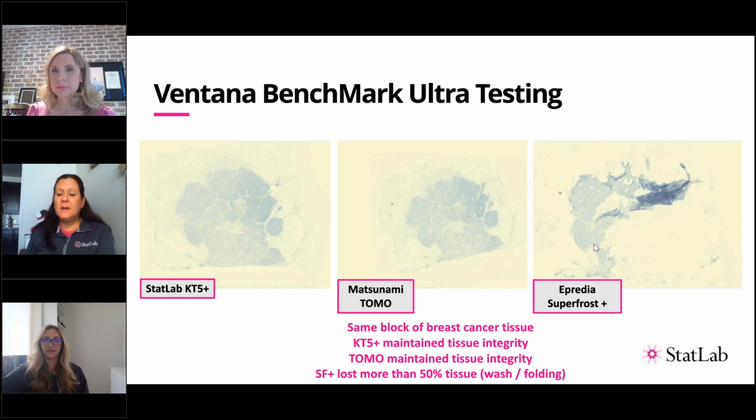I mean, again, I think that the biggest impact, for me, would be the time. If I didn't have a recut already cut on that slide, then I would need to take the time to go back and recut it. Take some time to dry it again. I would probably increase the drying time this time, and then have to rerun that stain. So that would be the biggest impact for me personally. For the patient, it's a huge impact if the area of concern is in that area.